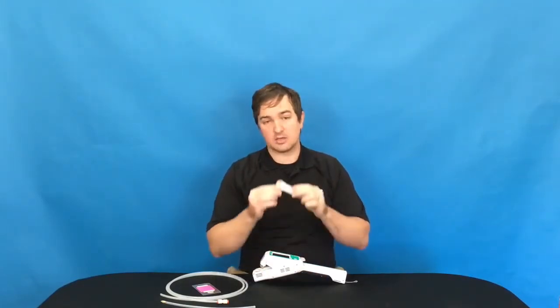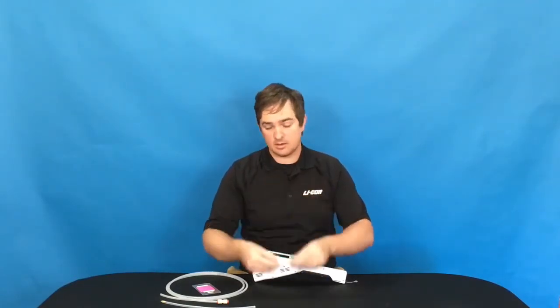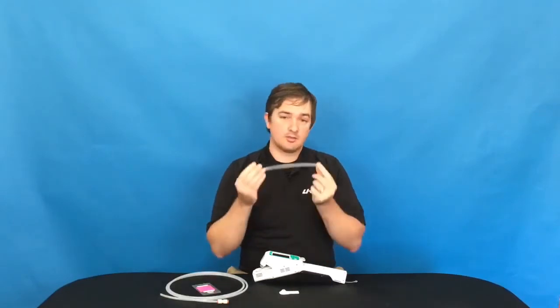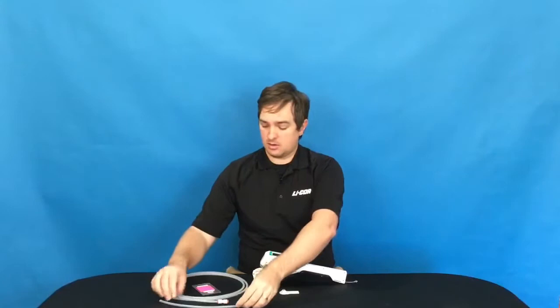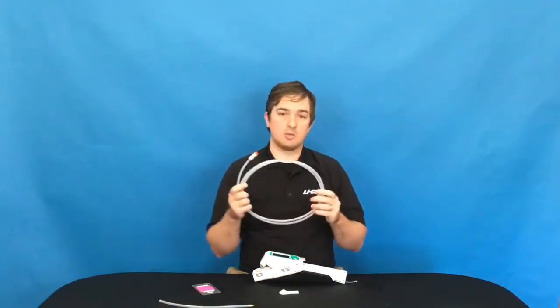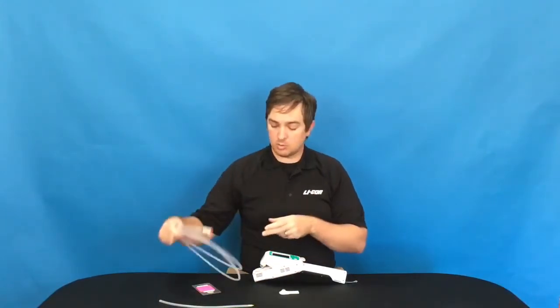The things you will need for this calibration will be the calibration clamp that comes with the instrument, the length of tubing with a hose barb for connecting to this clamp, and some other length of tubing to run to your dew point generator. I would recommend using as short of a length of tubing as possible so that the water vapor flushes through the tubing more quickly.